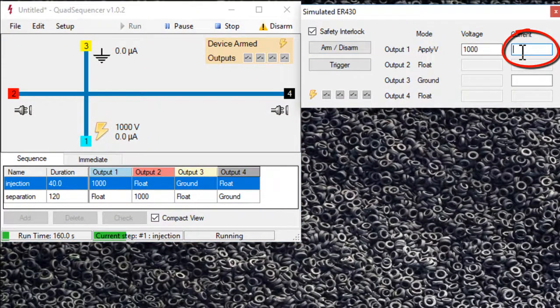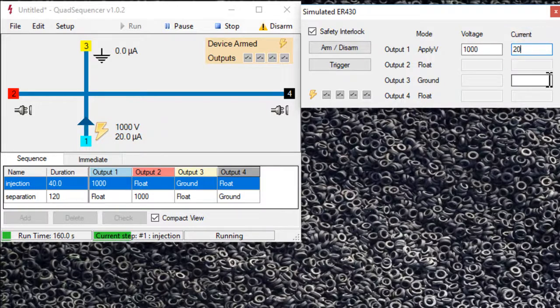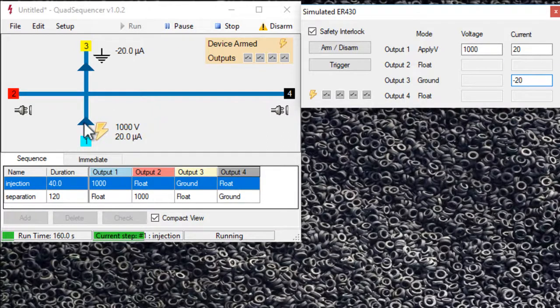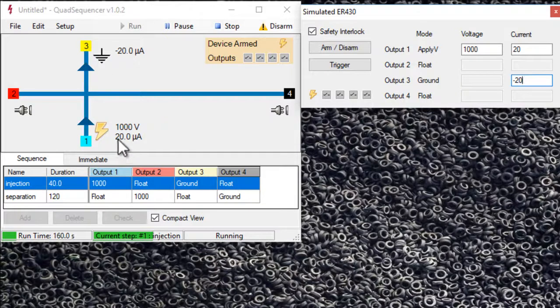We can enter that here. For example, this could be 20 microamps, reservoir one, minus 20 microamps, reservoir three. So now it's put these arrows to show the flow of current. And it's labeled 20 microamps minus 20 microamps here.